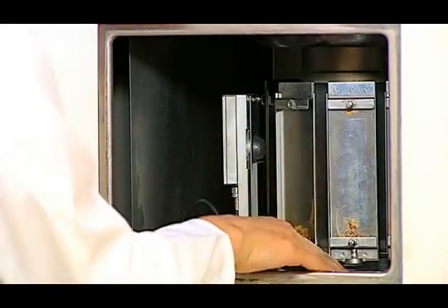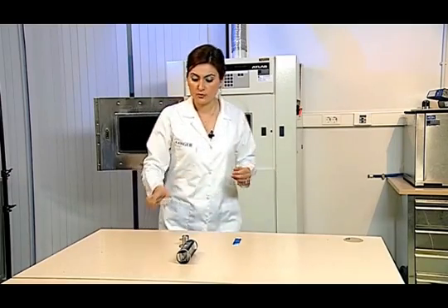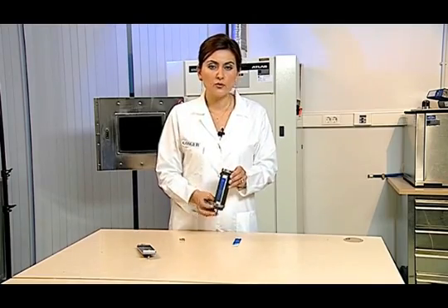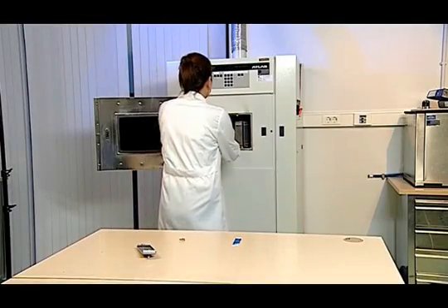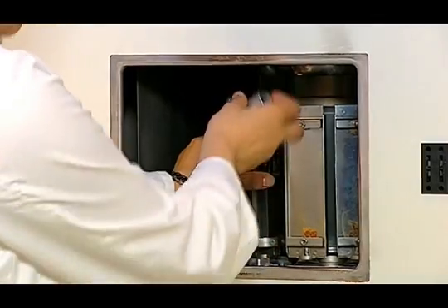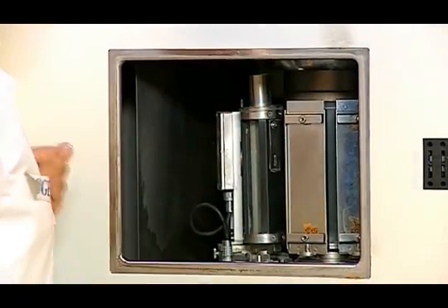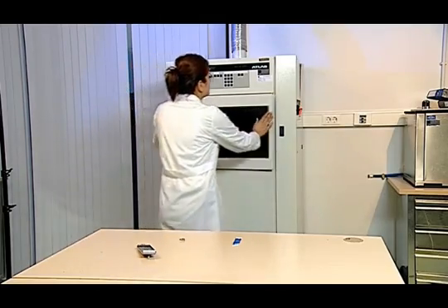The most important point in this test is that we must be careful not to exceed 60 degrees centigrade when drying the sample. We place the holders and reference samples inside the device. This is a special holder that prevents the reference samples from getting wet. We close the device after placing the test samples.